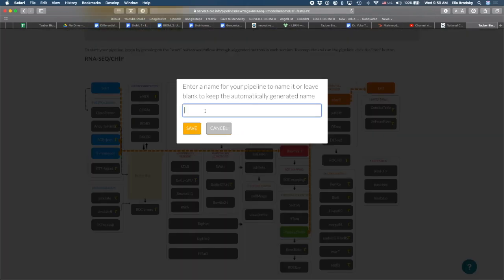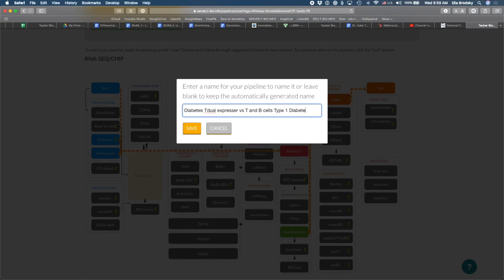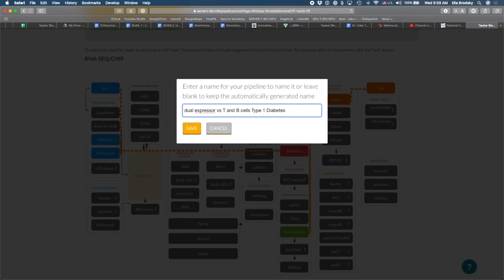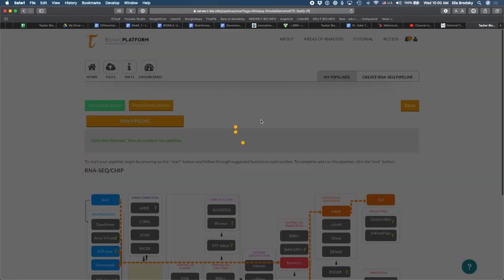And I'm going to just save this. So diabetes cell lines, or no, these are T or dual expressor versus T and B cells. Type 1 diabetes expressor. And I'm just going to say that this is edge R and run this pipeline.